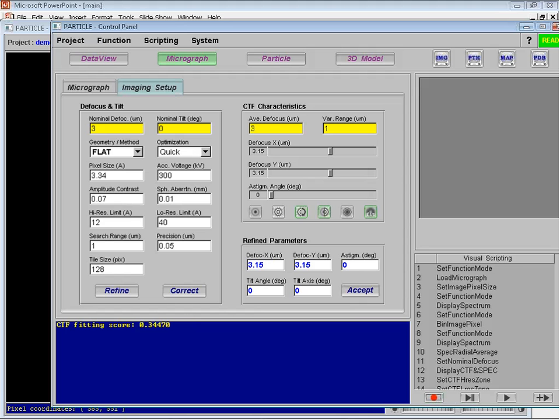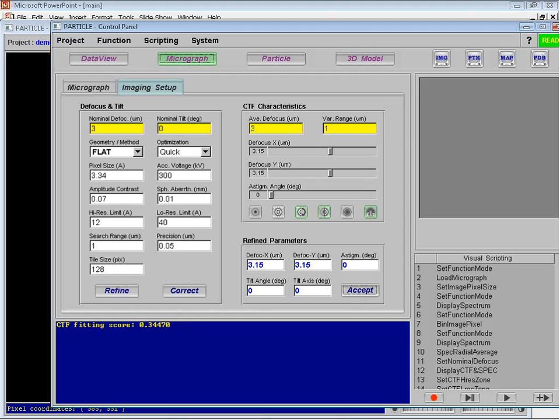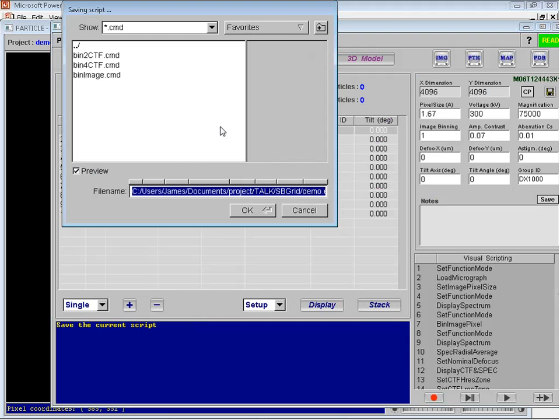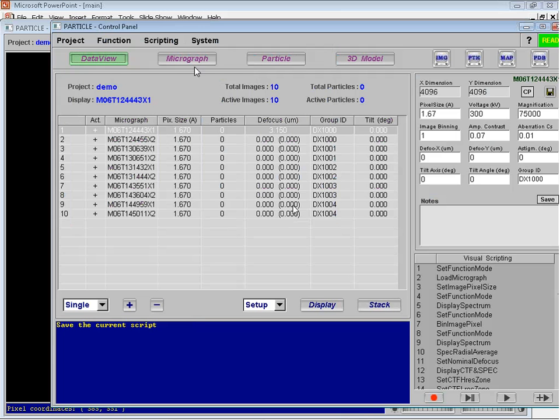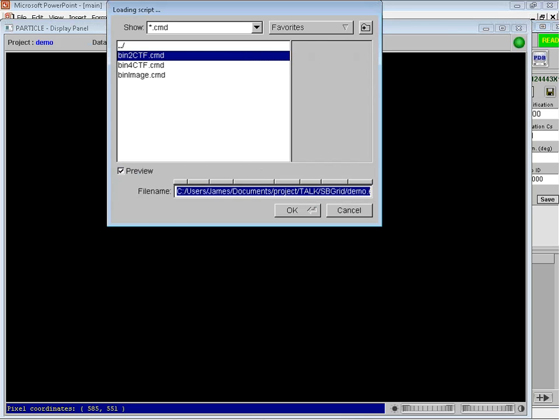Now I can just finish recording and come back to tell the system to run everything by using the same procedure. So now I'm going to demonstrate that. We can also save this script for future use, give it a name, and save it. Just for safety, because of this live demo, I'm going to open up a pre-tested script and demonstrate the idea.